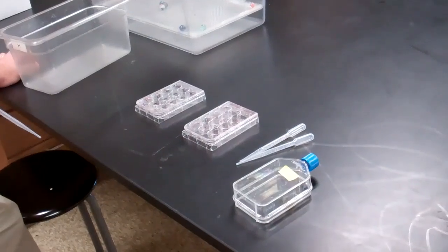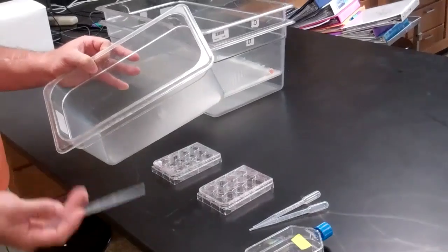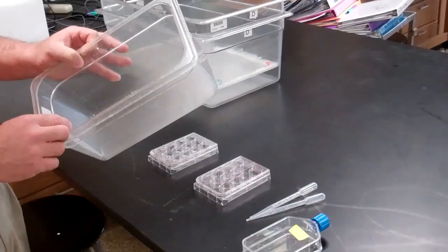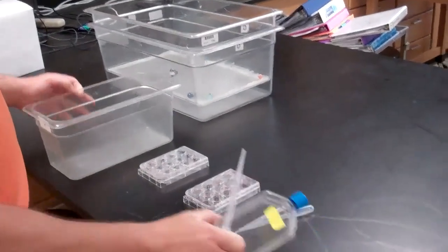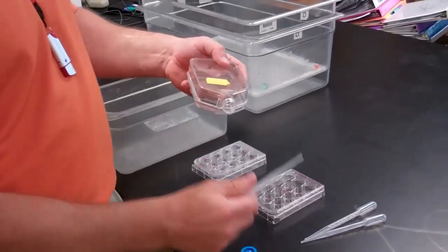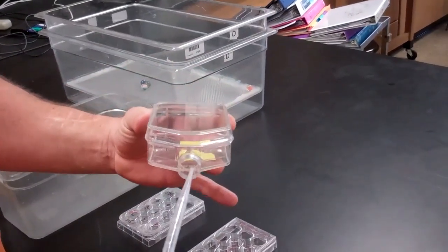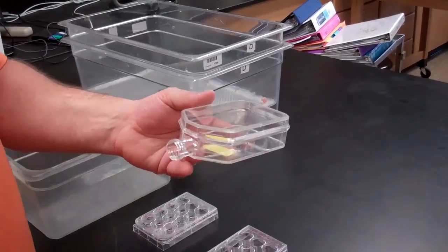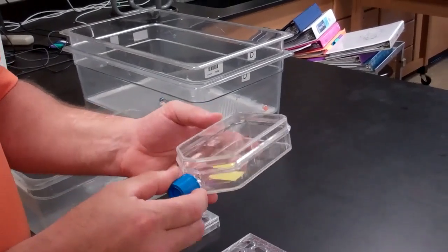Once I have the eggs in the chamber, you have to handle them pretty carefully. You'll bruise and damage the eggs. So I would extract the eggs using my pipettes and put them in this chamber here. I found that by tilting this, I could acquire the eggs nice and easily. If you're using a water incubator, the other nice thing is that these would also float on the water, and you could incubate your eggs that way.